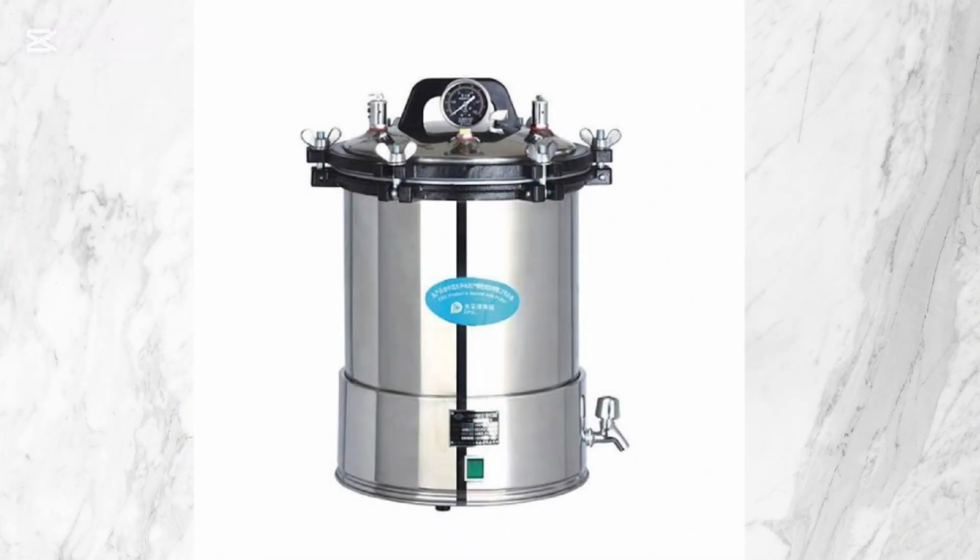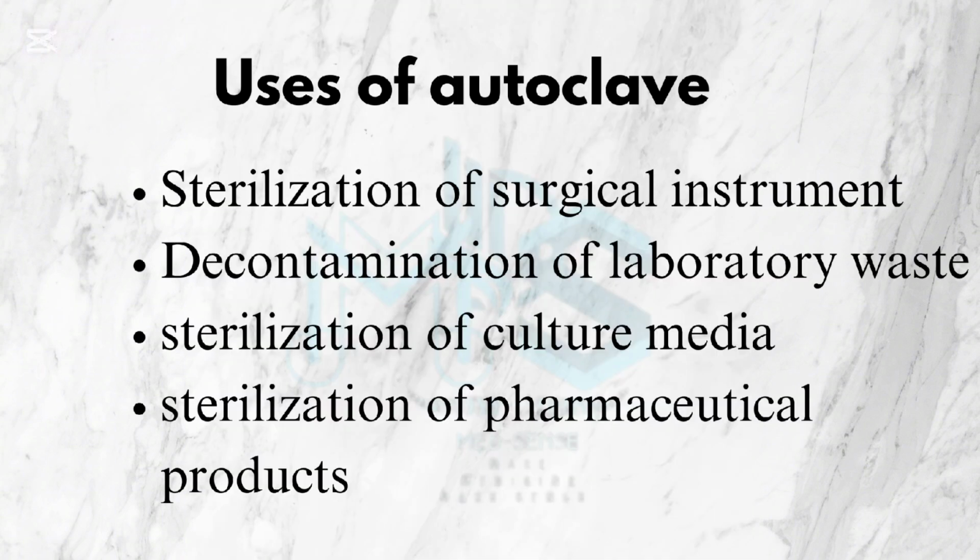Now, this is the picture of an autoclave as well. So that's all you need to know. Uses of an autoclave: sterilization of surgical instruments, decontamination. We also have sterilization of culture media, sterilization of pharmaceutical products, etc.